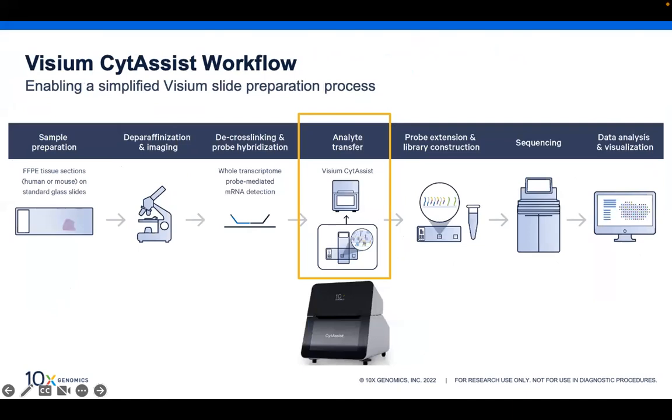In terms of the workflow, this is very unique. There's a lot of opportunity to expand the tissues you're working with here. This front end portion here, when you're working with this slide here, this can be cut fresh at a site, at a lab. They can section an FFPE block, put that section on the slide, move forward with it. Additionally, if collaborators are working with a location that has CytAssist, they can cut sections onto a slide and send those slides in. Since you're not working with a slide with a delicate surface to it, you can now put it on a plain slide and send them in, whether it's across the city or from the other end of the country, from the East Coast in this case. So it really opens up the options there.